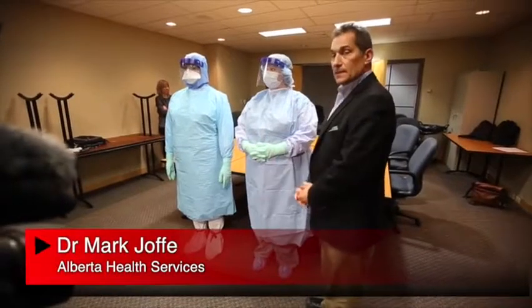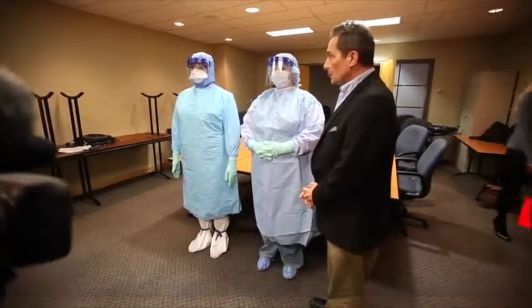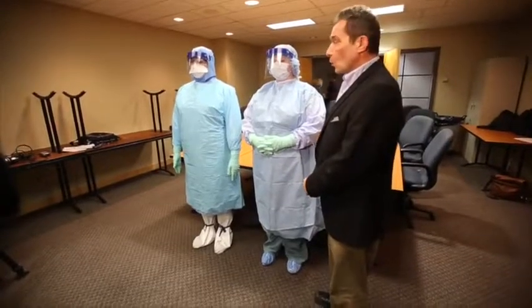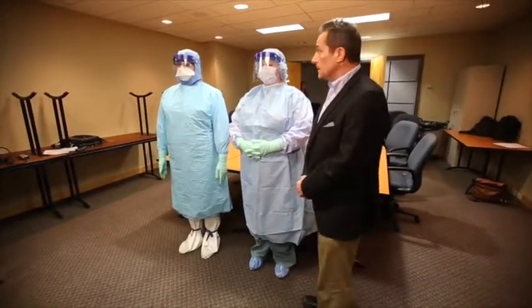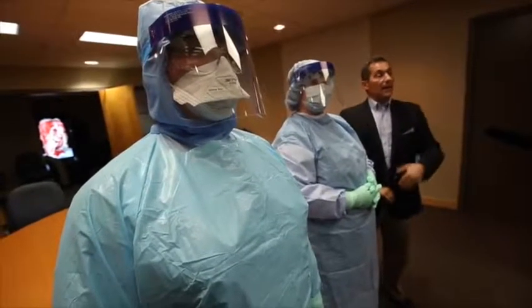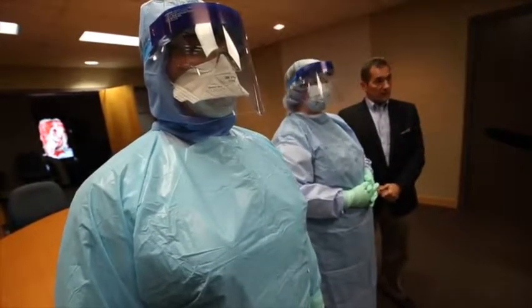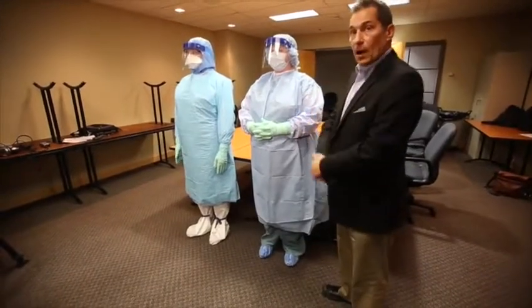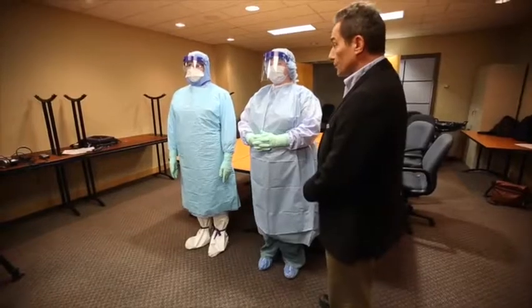What we're demonstrating here is the personal protective equipment that would be used in the situation that we are dealing with somebody that has suspect or confirmed Ebola viral disease. We have a healthcare worker wearing all of the protective gear, and a buddy who would be assisting this healthcare worker in putting on and taking off that equipment in order to ensure that there are no exposures.